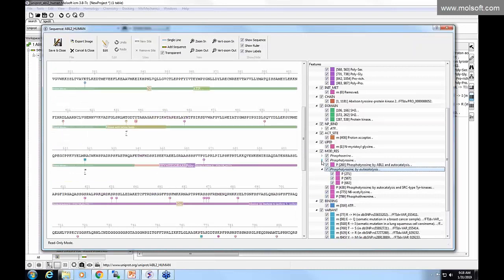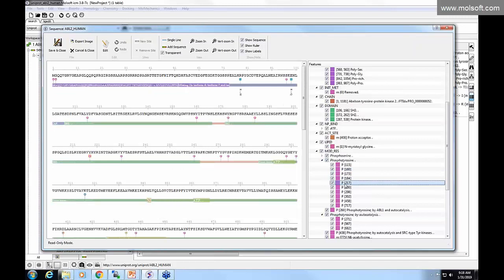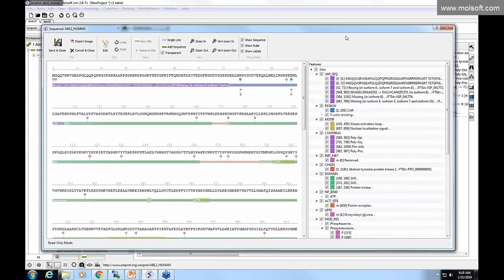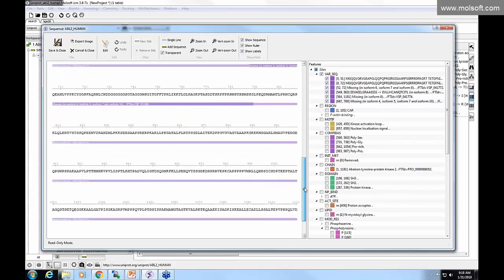So some of these have more detail underneath. If you expand, you can go to those regions. So we can toggle this display on and off in the sequence editor just by clicking on sites. That would undisplay everything or display everything. Or you can be more specific and just use the check buttons, and this just shows certain regions here.